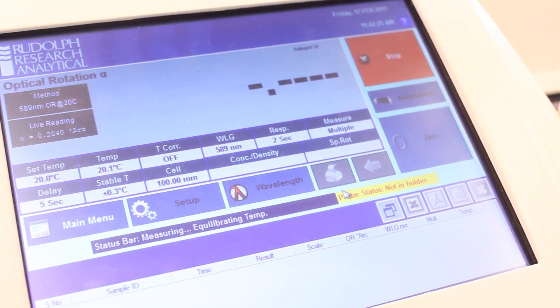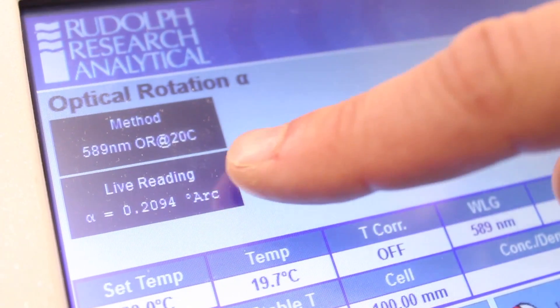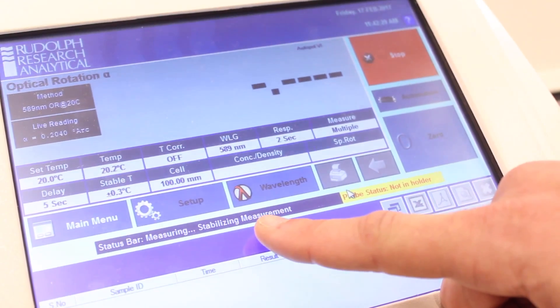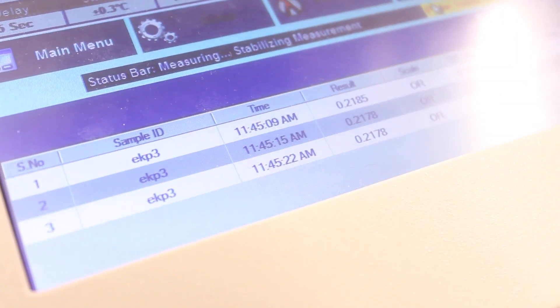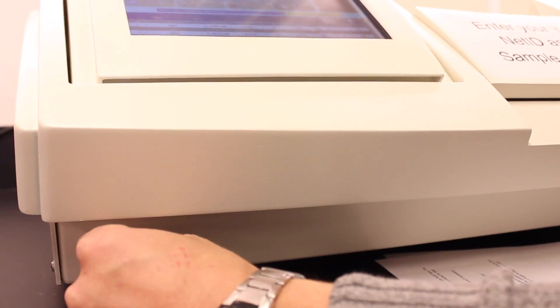After all the information is entered, the instrument will automatically start collecting data. The current real-time reading is shown in the upper left-hand corner, and after the instrument and possibly the temperature has finished stabilizing, the readings will be tabulated in a table at the bottom of the screen. You can transfer the data by hand, or you can use a USB drive to transfer the data electronically.